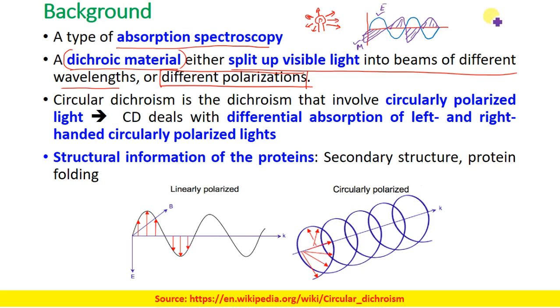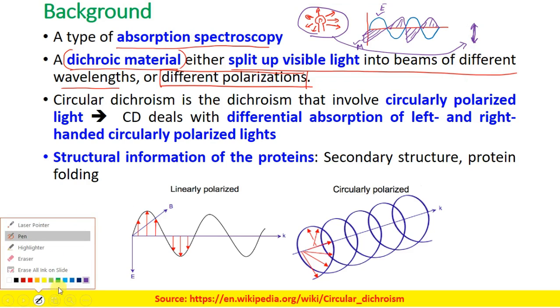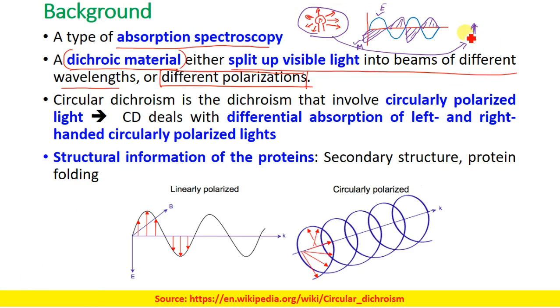Okay. Now under this condition, this is only a single beam. Now suppose in 360 degrees we can represent this source. This is just a schematic representation for your understanding. Suppose there might be an electric field which is moving up and down. There may be another electric field which is perpendicular to the first one.